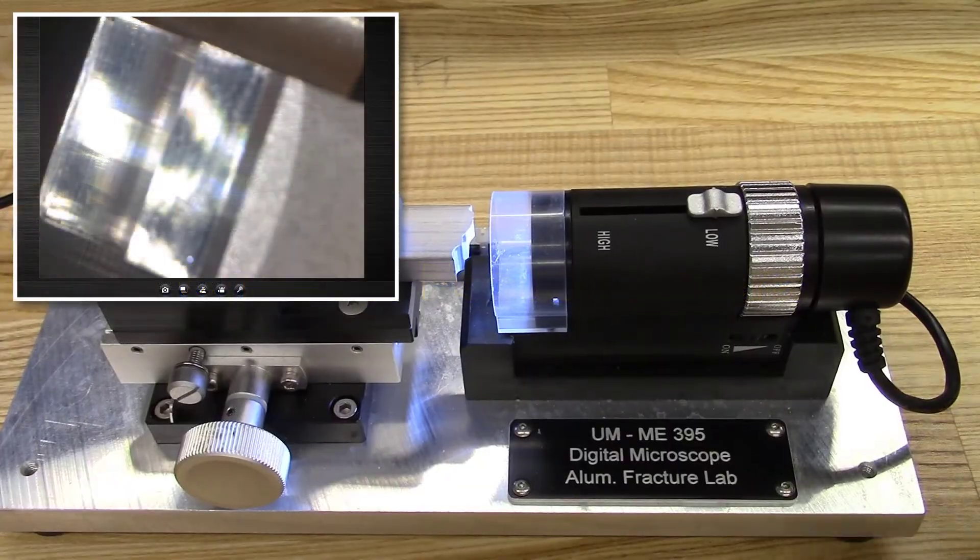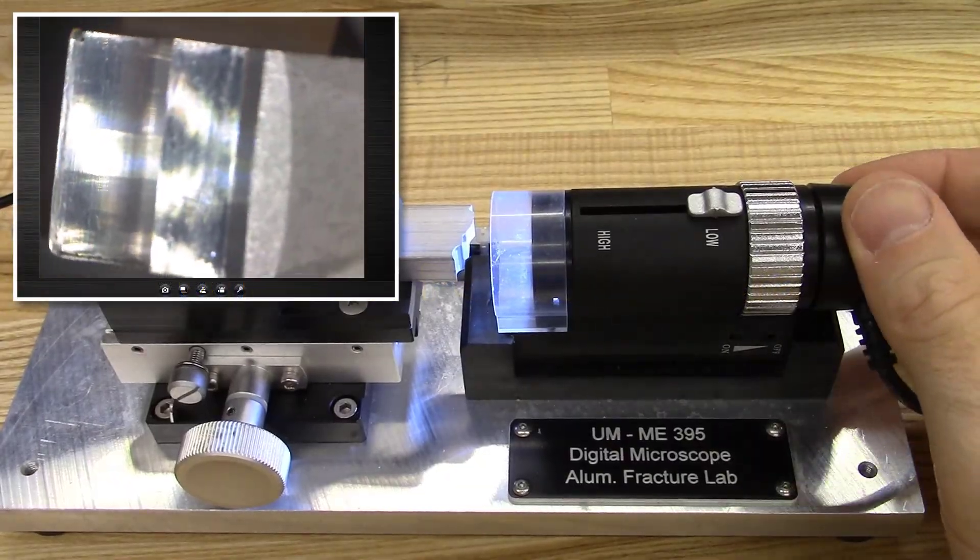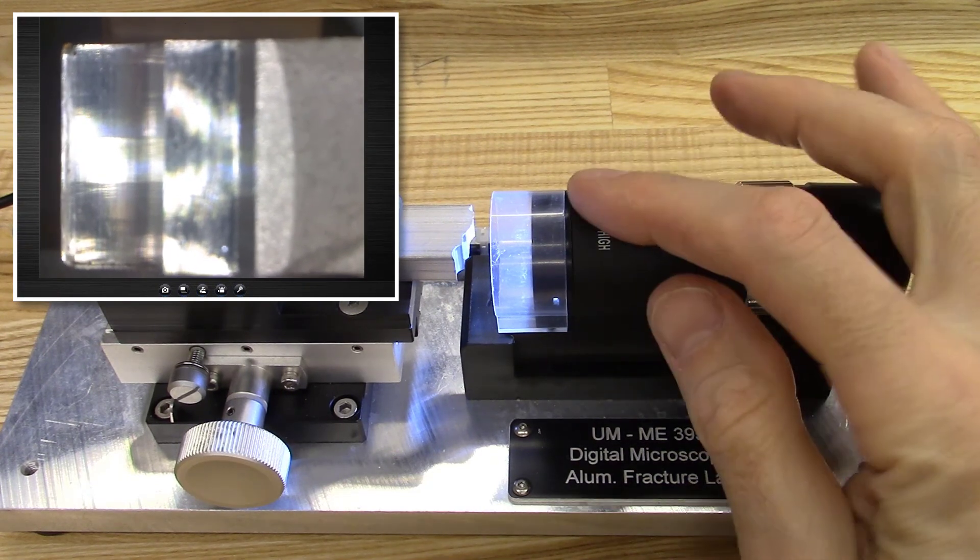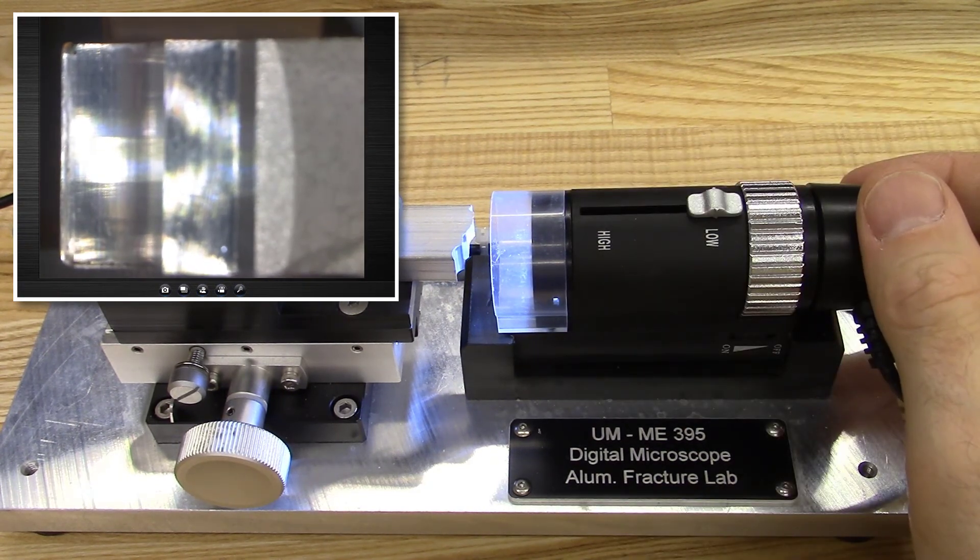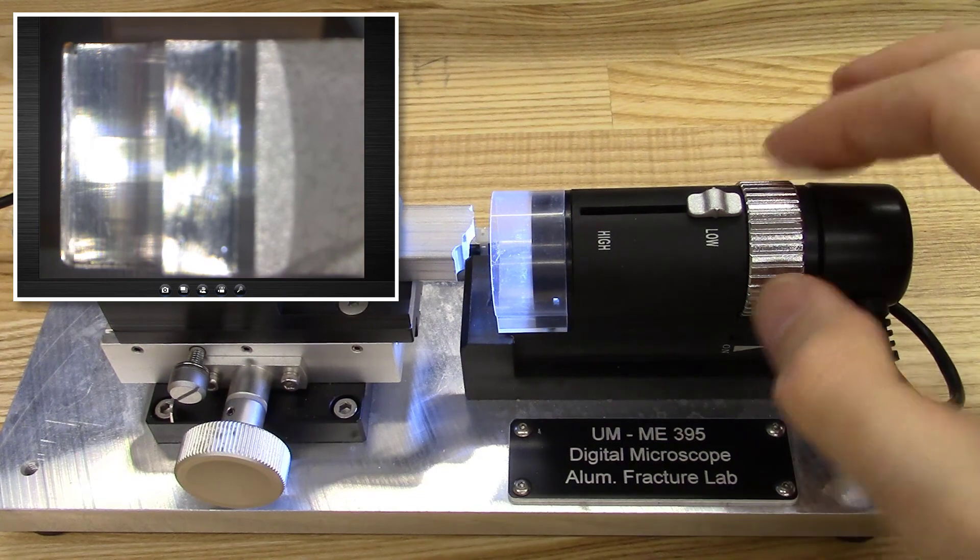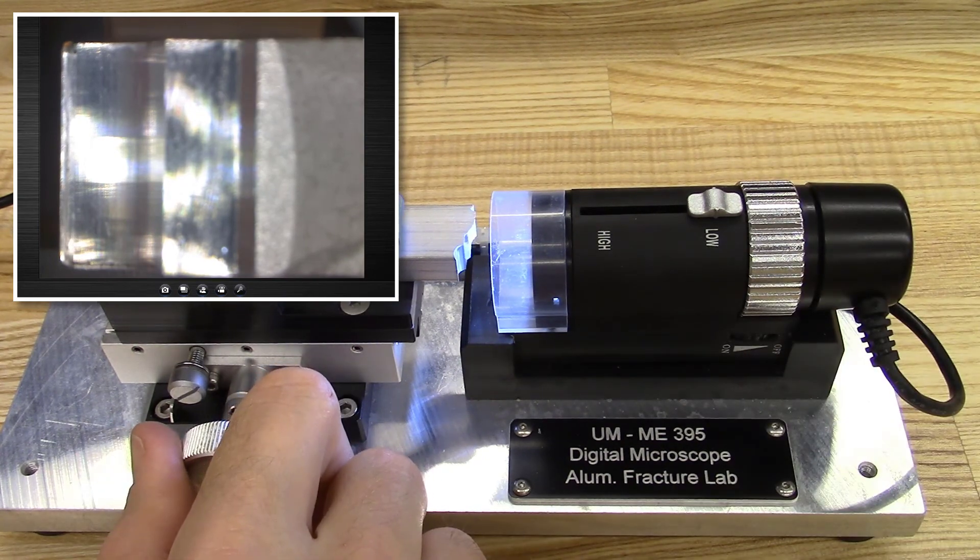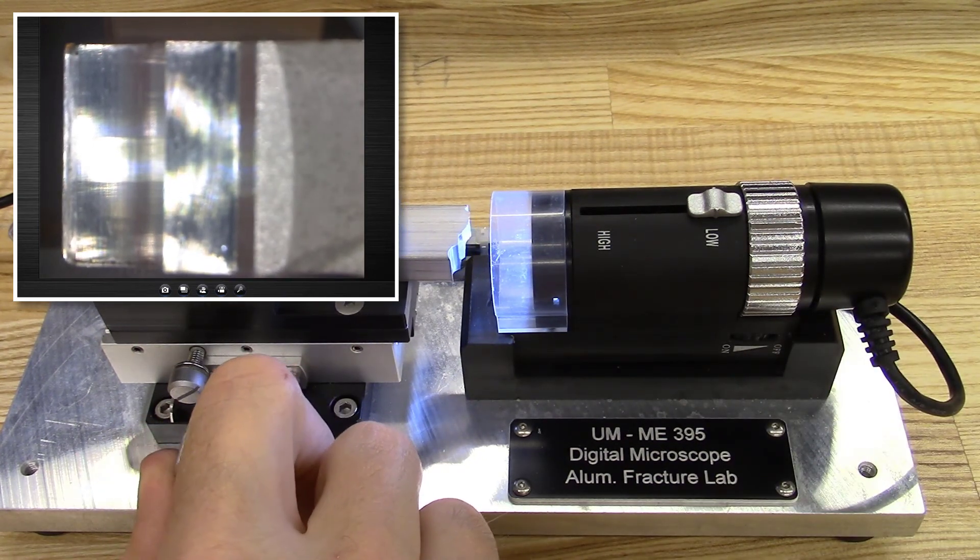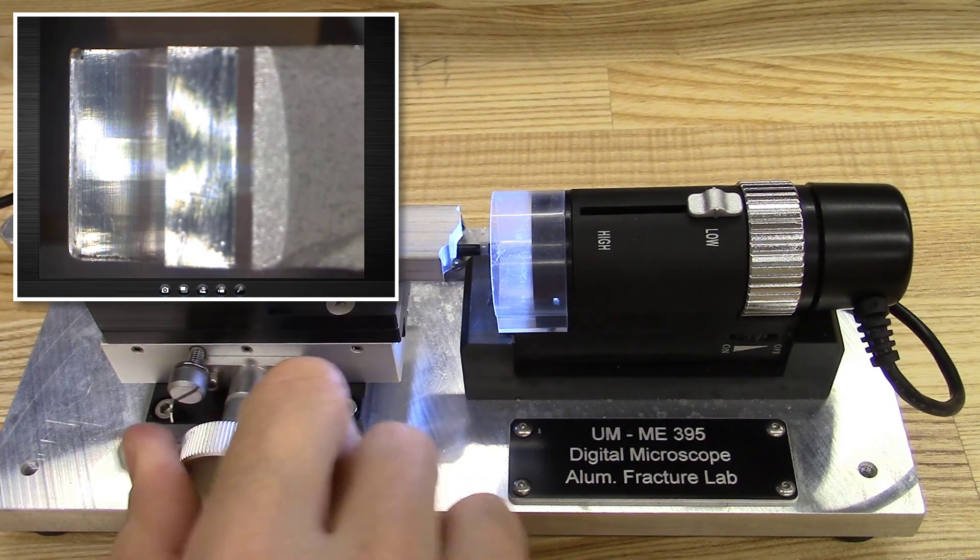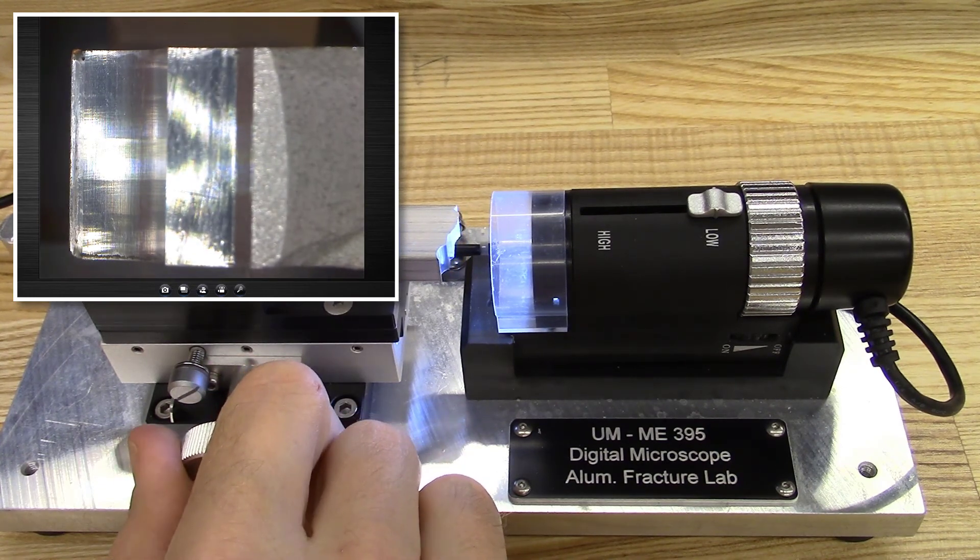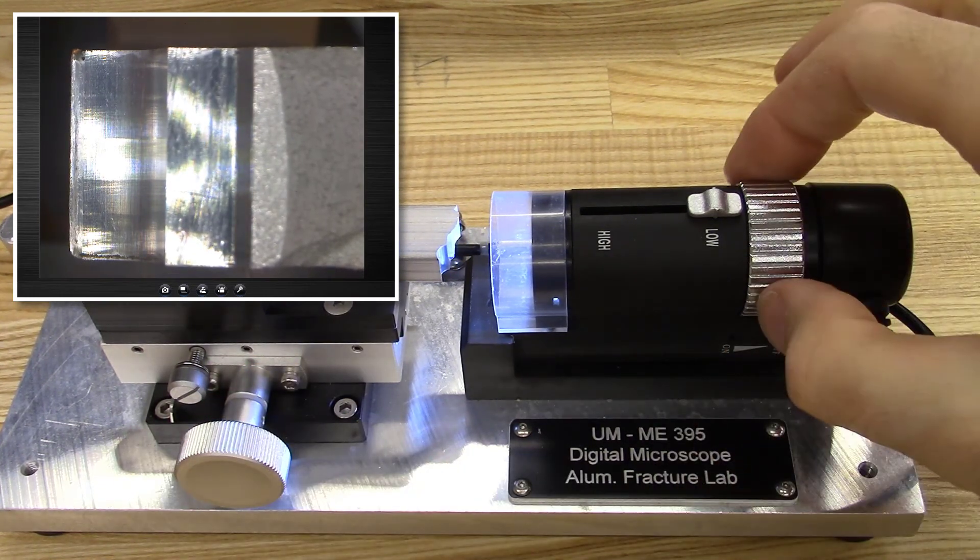Rotate the camera to orient the image on the screen. Ideally, the specimen edges are parallel with the image frame. Use the stage position dial to adjust the field of view and focus to a certain extent. The silver ring on the camera is used for fine focus.